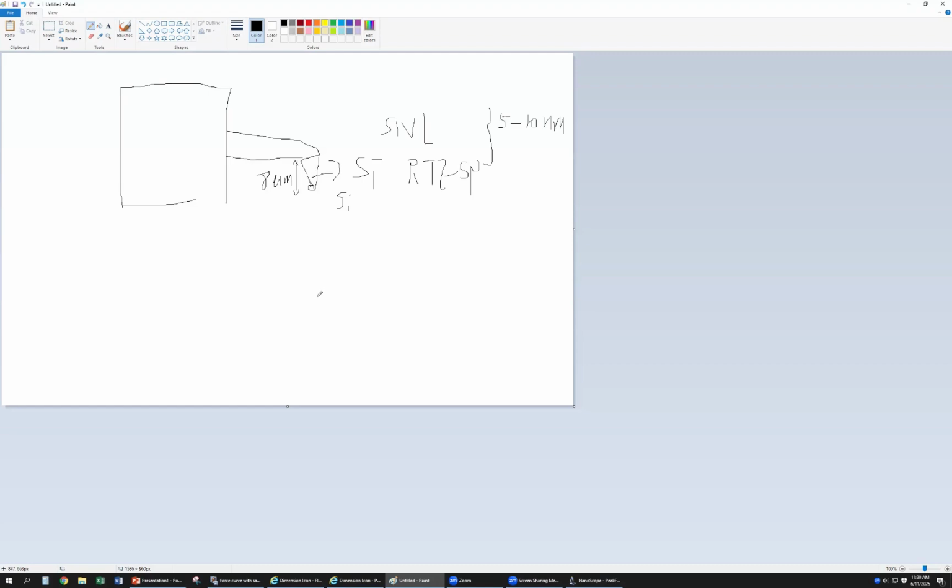But for some bigger samples, for example, like the cell, this height is already over the 8 micron. Then when your probe goes to the bottom, your cantilever will hit here, so you cannot make the correct image.